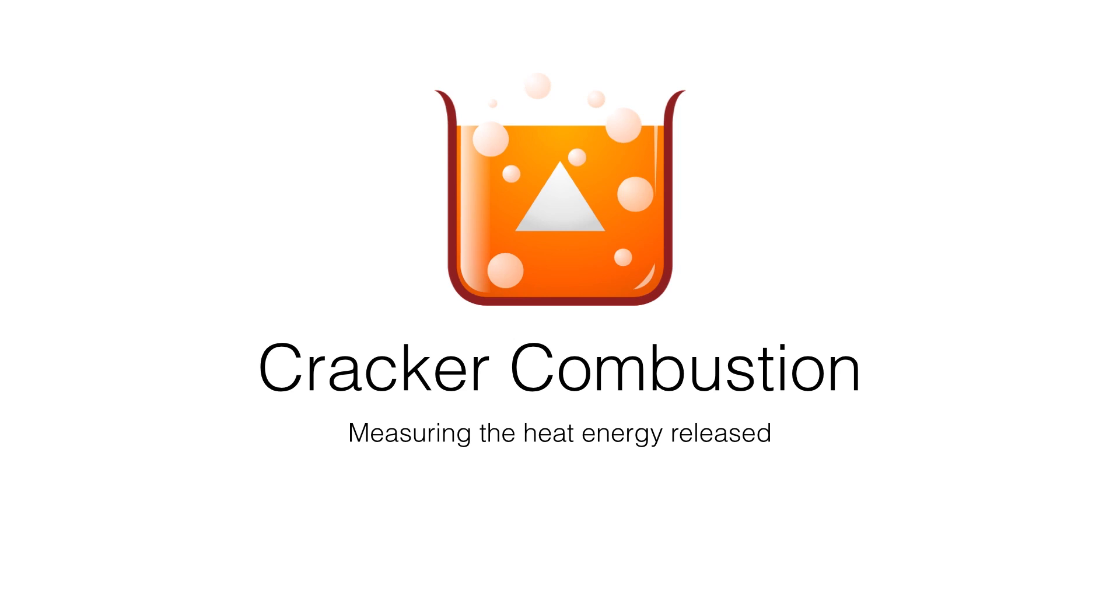Hello and welcome. Today's video is about cracker combustion, measuring the heat energy released. Why would you burn crackers? Sometimes it's by accident, but for science we do it on purpose.